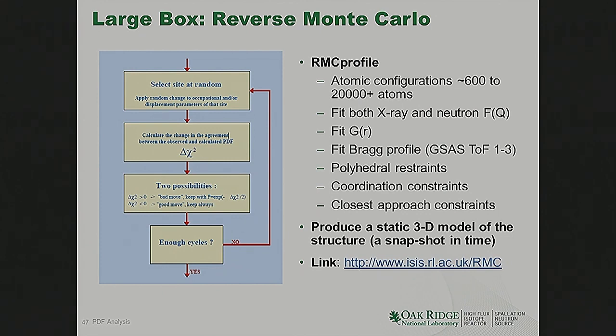And actually, some of the newer developments, I think being led by Igor Levin at NIST, are in incorporating things like XAFS and even now electron microscopy into this software. And so they're really going towards a workbench style approach where you can, with one large atomistic model, fit all kinds of different experimental inputs.